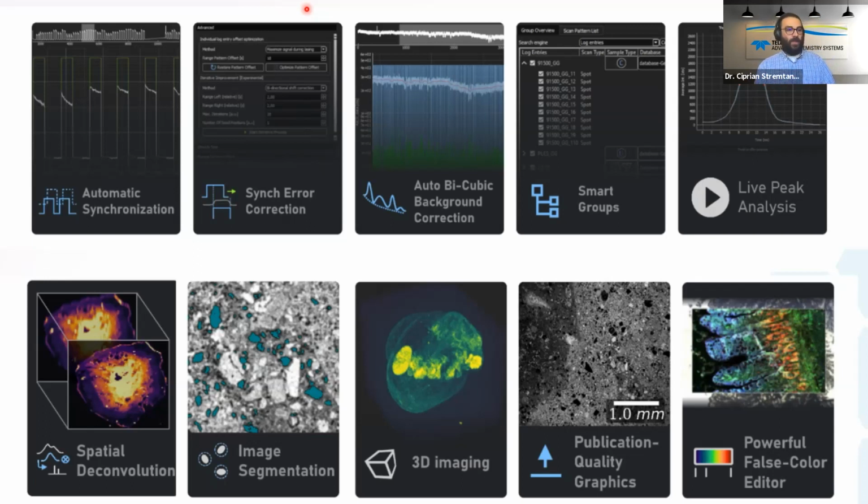And it can do a lot of other things. In some instances, it can stream data live from the instruments. It can do all sorts of image segmentation, and I know this is a key aspect for biological imaging, just because there's a lot of different techniques used within the field of imaging, and being able within one software to overimpose an image from a laser ablation experiment with microscopy, confocal microscopy, or any other sort of image generating technique, and then perform all sorts of image segmentation procedures is quite important.